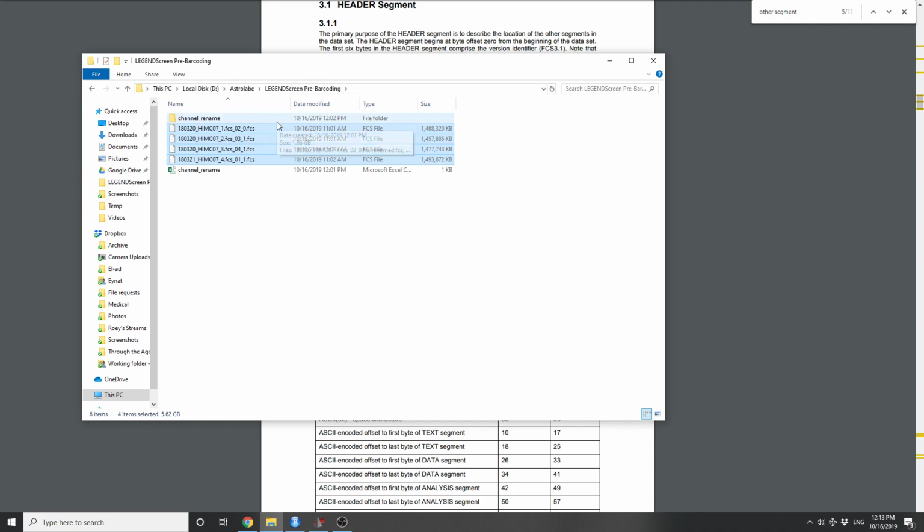That other section can be quite big. It is introduced by the Fluidigm acquisition software. To be honest, I'm not exactly sure what that section is about. However, to the best of my knowledge, it should not affect any downstream analysis. Once you're done with normalizing your FCS file using the Fluidigm software, you really don't need that section anymore.